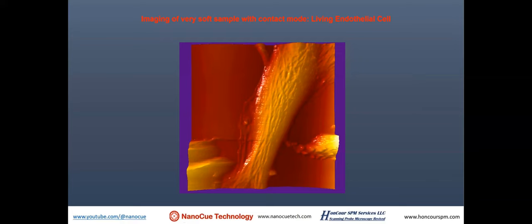In this particular case, as I mentioned before in previous presentations, it is key that your tip is not very sharp. The tip has to be slightly polished by scanning on a silicon surface, because a very sharp tip will actually disturb the biological soft samples. And this scan size is near 100 by 100 microns, and the sharp tip does not benefit you anyway.